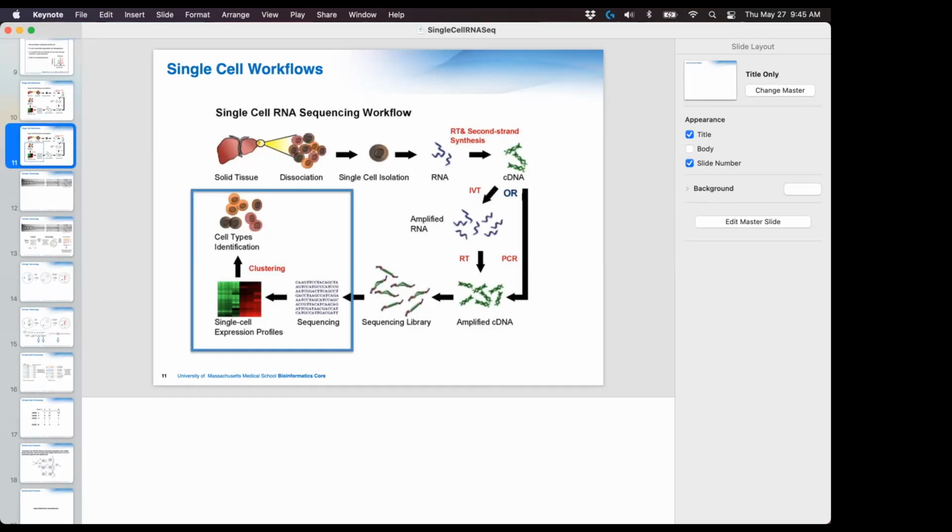That means some genes might have been PCR'd more times than others. For example, maybe a particular actin beta transcript was amplified 1,000 times, and some other rare transcript, say CD14, was only amplified 2 or 3 times, just by chance, because this is all a numbers game.